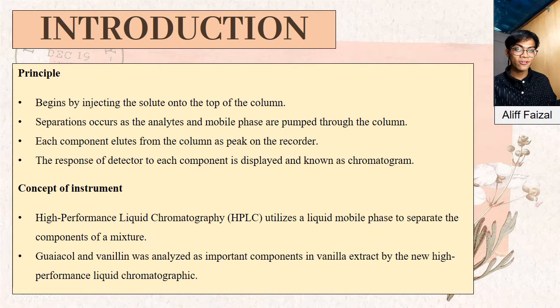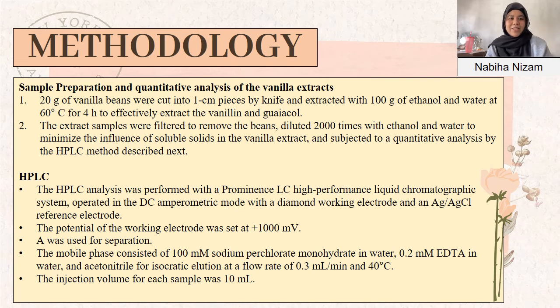So the concept of the instrument is that high performance liquid chromatography utilizes a liquid mobile phase to separate the components of a mixture. And then the experiment is on guaiacol and vanillin. They were analyzed as the important components in vanilla extract by high-performance liquid chromatography. Next, the methodology of high-performance liquid chromatography.